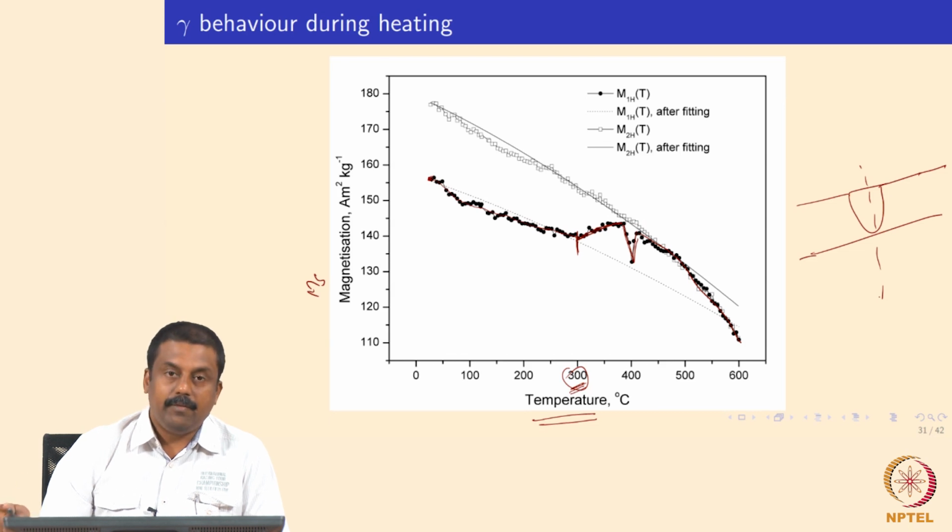So we'll summarize here. We looked at the variation of retained austenite along the microstructures of the heat affected zone, and we also looked at the stability of retained austenite as a function of temperature, and what techniques we can use to measure the retained austenite in the weld microstructure. We move on subsequently in the next lectures to how the retained austenite fraction varies as a function of peak temperature reached in the heat affected zone.